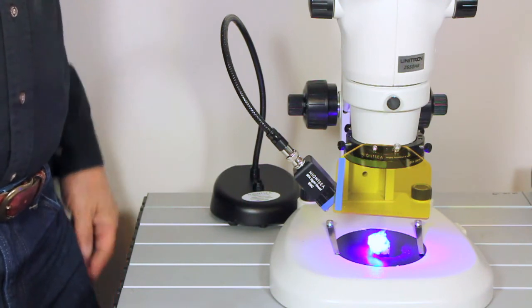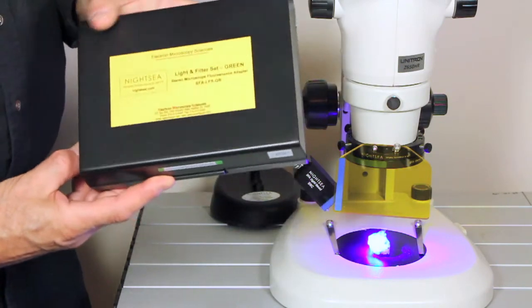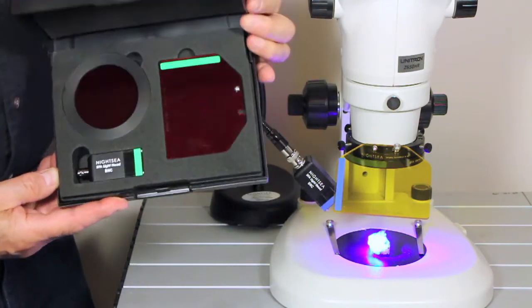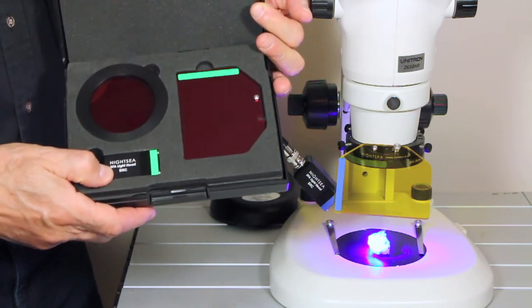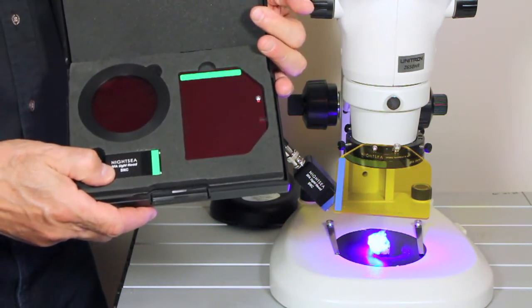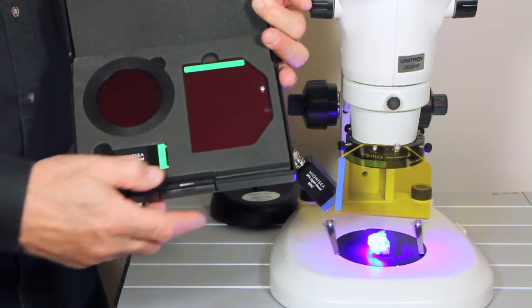If you need another excitation emission combination, they come in a nice little kit like this. Foam on box has the excitation light source, in this case indicated by the green for stimulating red fluorescence with the matching red barrier filter and shield.